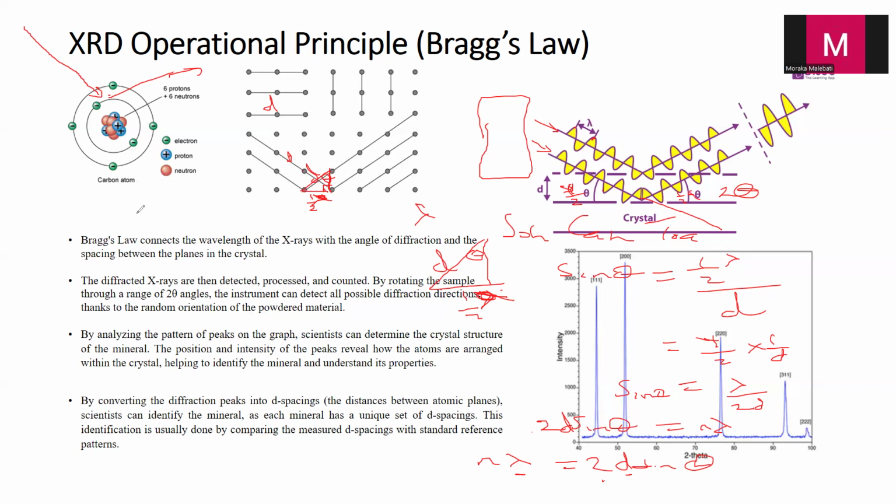As you keep rotating the detector, the sample also gets rotated, so that the sample can be analyzed at multiple angles, so that you can have a representation of the data within the sample. Thanks to the goniometer.